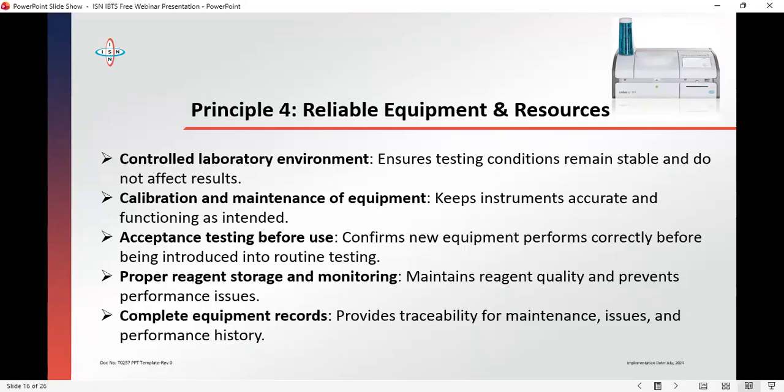If we did not have that EQA, that's how we probably would have been sending out results that were wrong. We filed for them to replace those reagents because we could prove beyond reasonable doubt that those things were not properly working, and they traced it to their supplier in France. They had a failure on temperature at some point, and it compromised them.